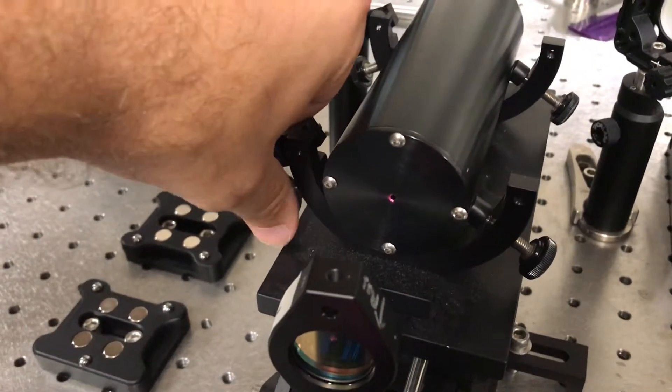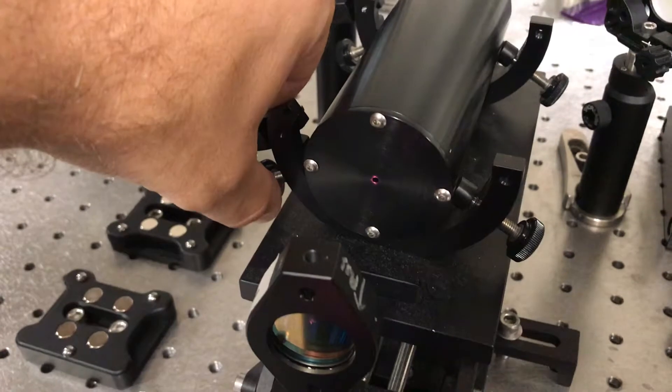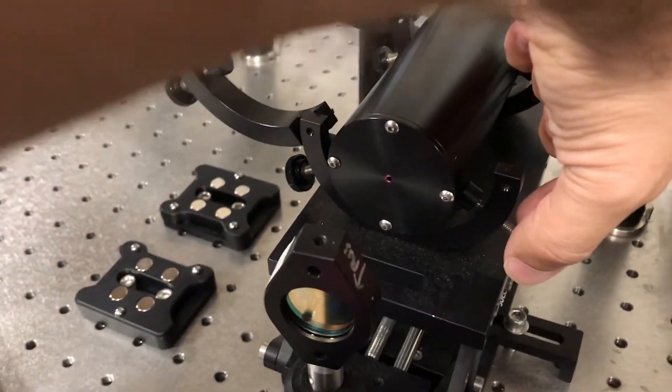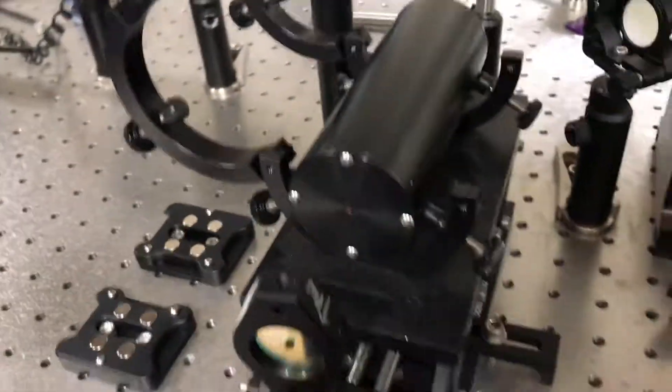Now, the aperture on this alignment tool is a little bit smaller than the actual aperture on the EOM, so it's like kind of a worst-case scenario. Okay, so that's pretty good.